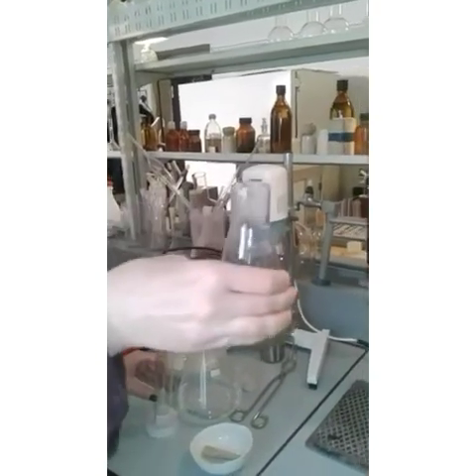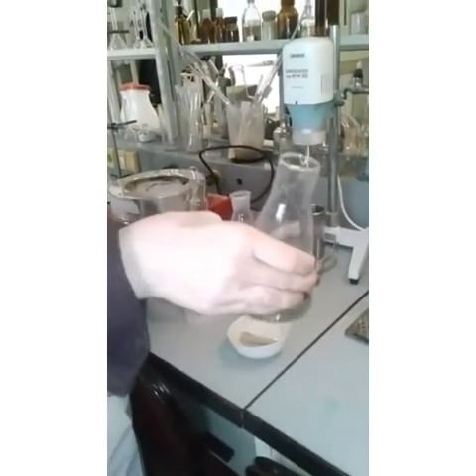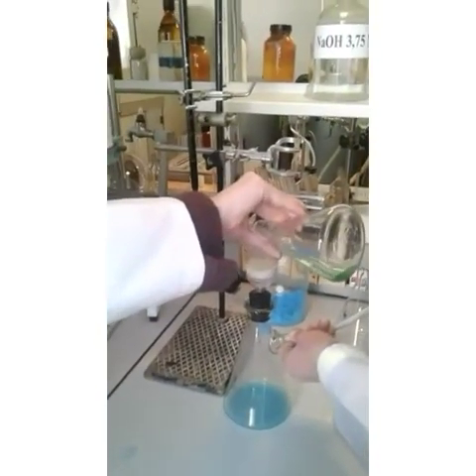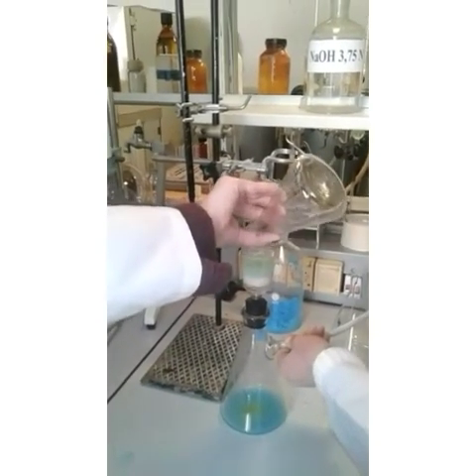Then we wash the precipitate with 120 milliliters of iron sulfate solution. As a result, the cuprous oxide is oxidized and iron 3 sulfate goes into the iron 2 sulfate form. Here is the reaction.